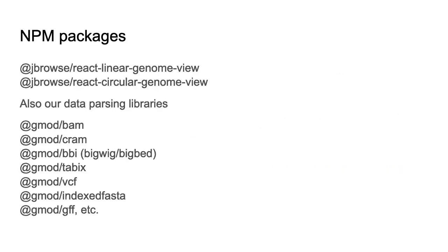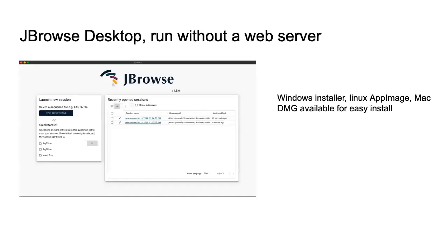And for web developers that like to get really into some of the details, we have our linear genome view and our circular genome view as standalone components, as well as our data parsing libraries if you're making your own tool that just needs to parse some data. And again, we have desktop, runs without a web server. Easy to install.